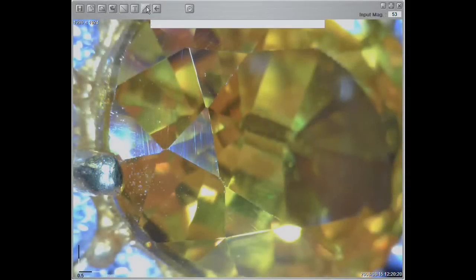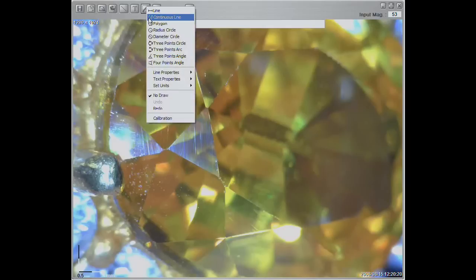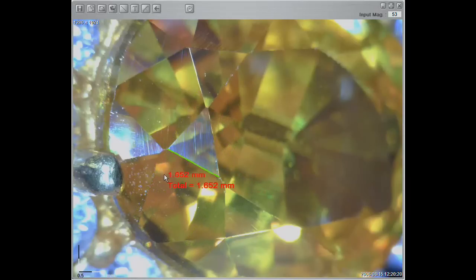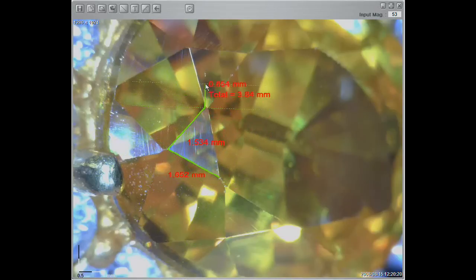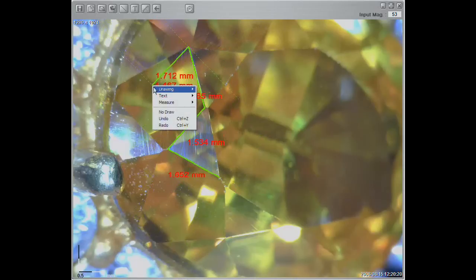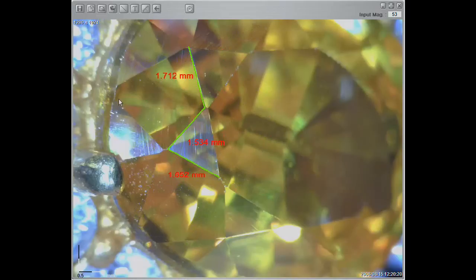Start measuring a continuous line by selecting continuous line from the menu. Left click for the starting point, again for the ending point, then place the results of the first segment. Continue measuring for the next segment, place the results where you want it, and repeat. When done measuring, right click on the mouse and select no draw on the menu, then finish by placing the total length where you prefer it.